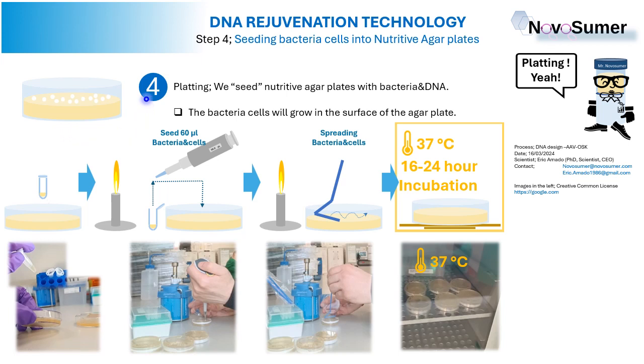This is a representation of an agar plate. The actual agar plate looks like this. These are 2 agar plates that are going to be seeded. And what do we need for this purpose? Well, first we need the eppendorf tube with the bacteria cells and the DNA that is inside the bacteria, and we also need the agar plates, the LB agar plates. These plates have a medium that is solid, kind of a gel, and have good conditions for the cells to grow.